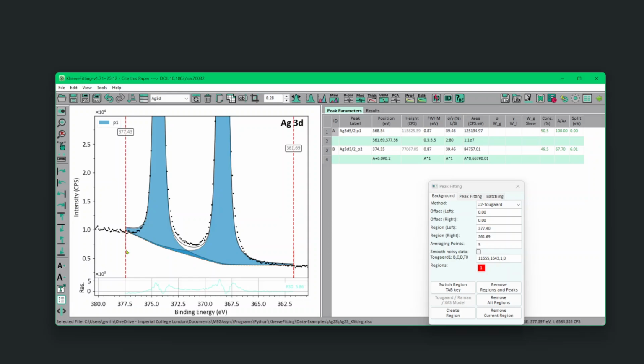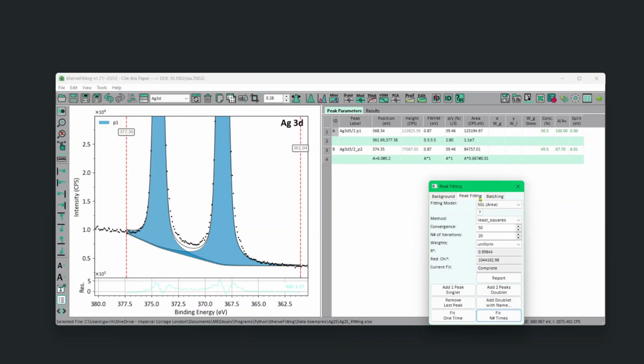And for U2, I will try to go around there, and that seems to be way better. So, fitting quite nicely here. Maybe let me go down here, and if I fit this now, this is quite nice, just not matching quite well here.